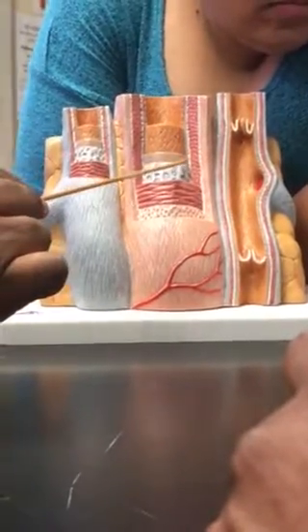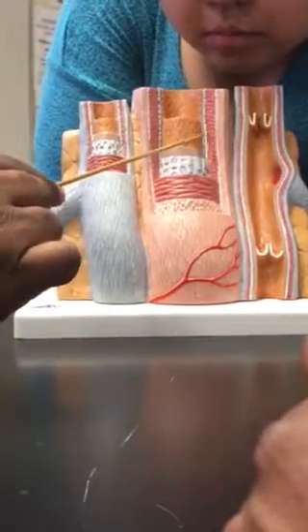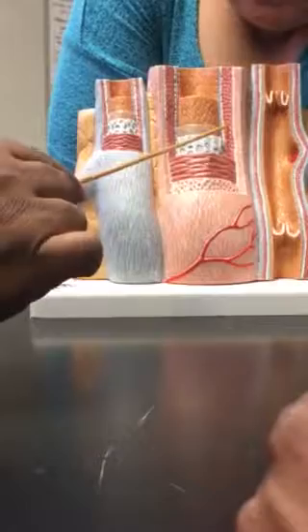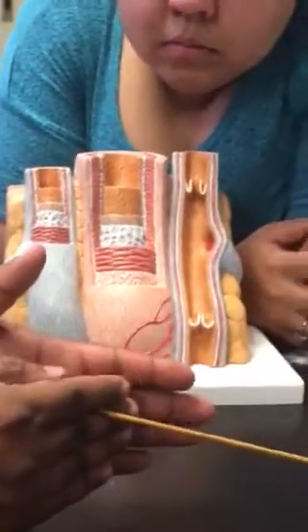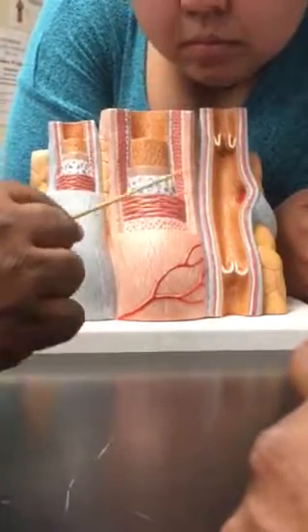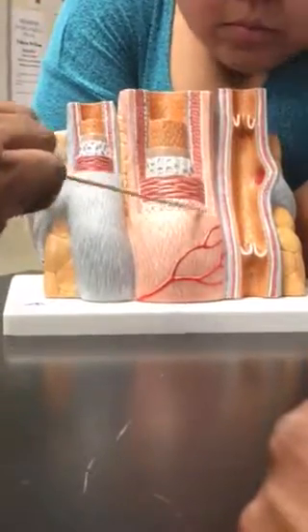After the internal elastic lamina, we could see the beginning of the tunica media. So this whole section is the tunica media. The tunica media ends with the external elastic lamina. Okay, so the tunica media sort of sits in a sandwich, whereas on either side of the tunica media you have the laminas, the internal elastic lamina and the external elastic lamina. Okay, following the external elastic lamina we have the tunica externa or adventitia, same thing, tunica externa, adventitia.